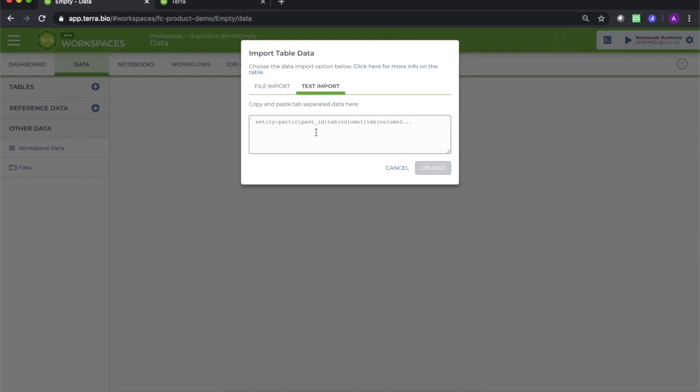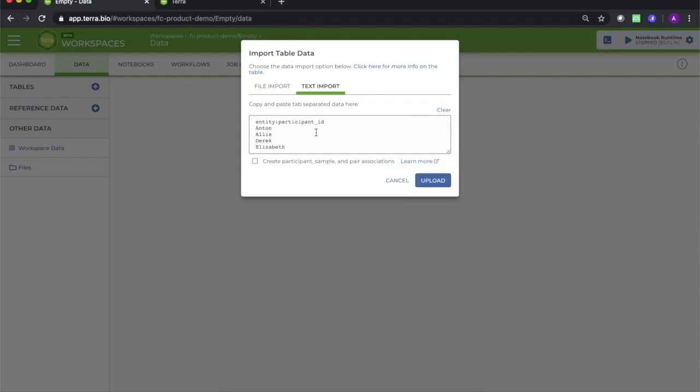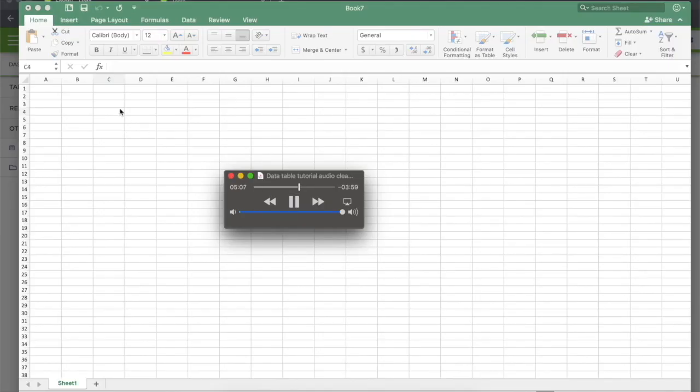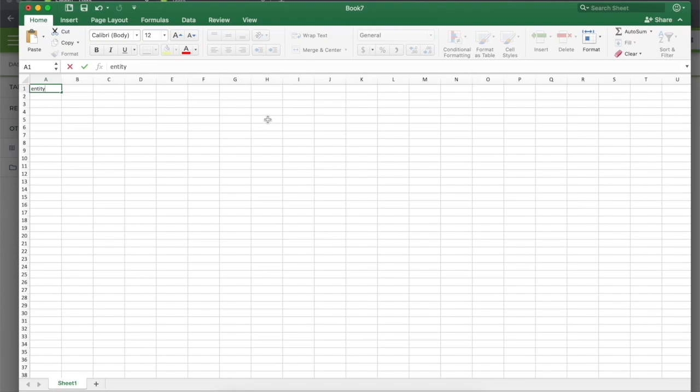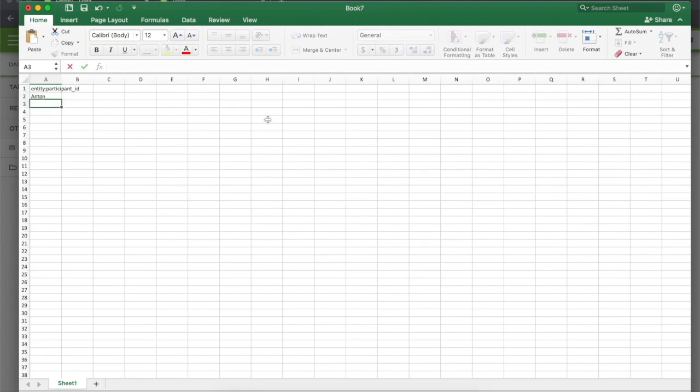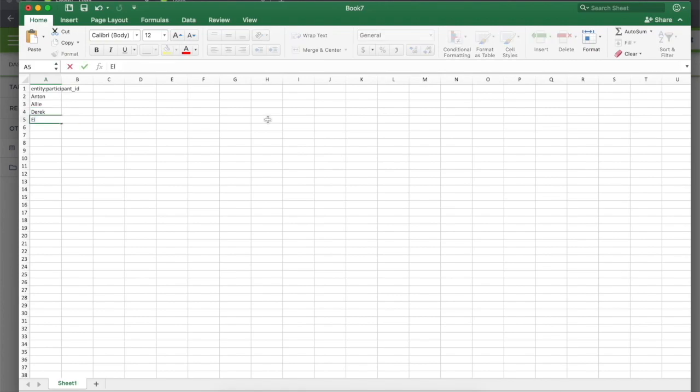Now let's create our most basic type of table from scratch. I will be using Microsoft Excel for Mac, but many programs will do just as well. A basic entity type in Terra is the participant entity type, which simply lists participants according to their participant ID.